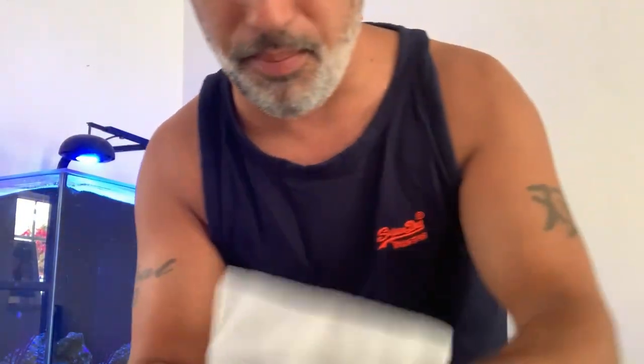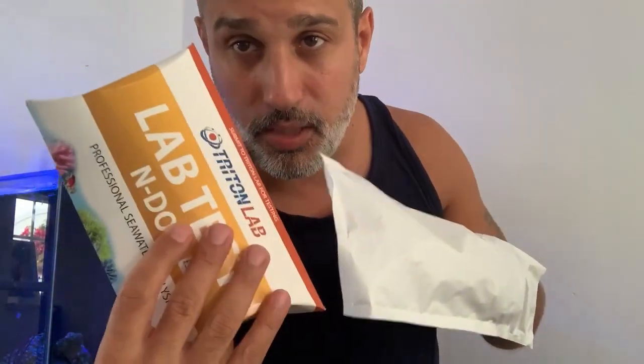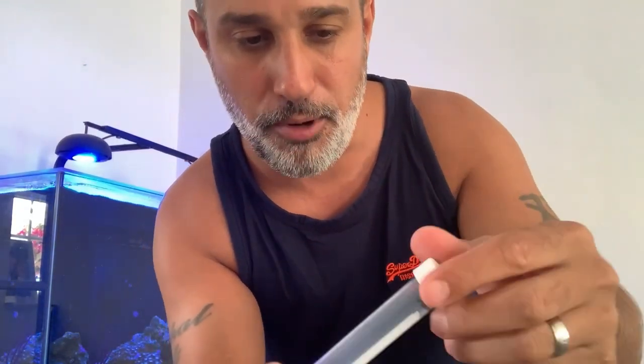You get your standard address label to stick on to send it off, and then you've got the instructions here which show you what you need to do. I've done these before but I'll show you now. Inside you've got the envelope — this is what you send it back with. You've got two test vials here and you pretty much just have to fill them up with tank water. The first thing we're going to do is log in and register.